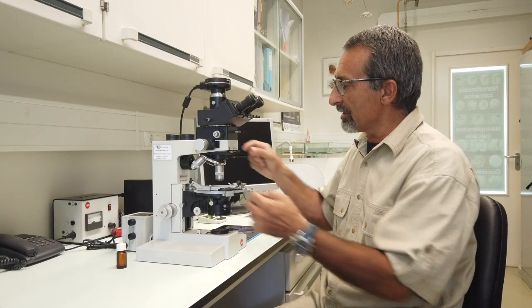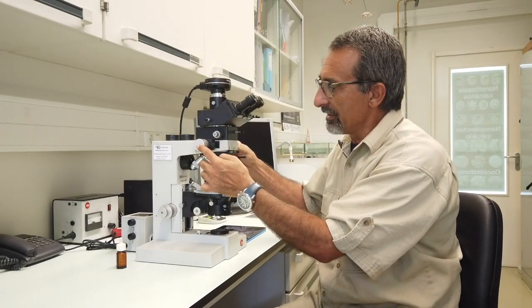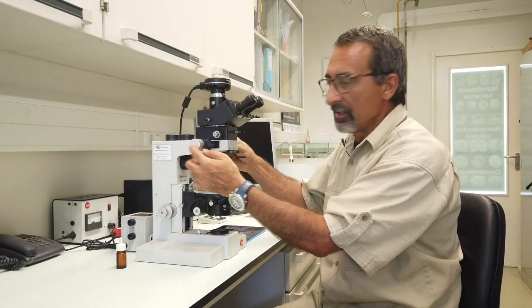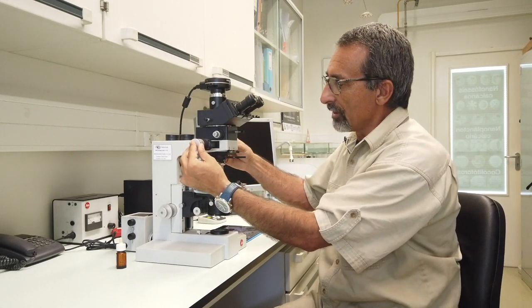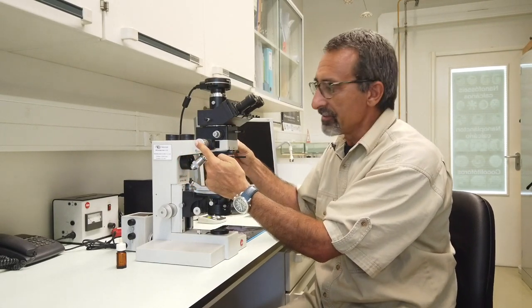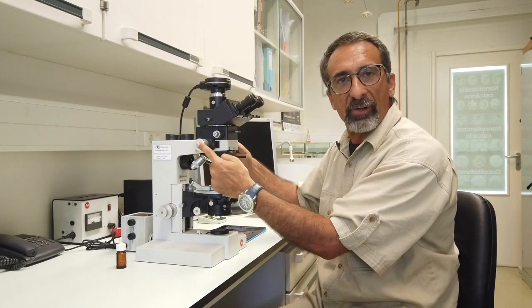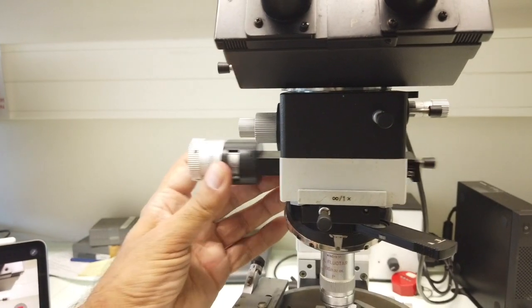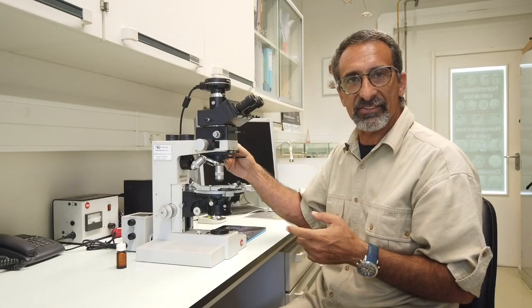We have here another polarizer. Here is the analyzer. We can remove it, we can insert it. So this is another polarizer that we'll discuss later on. It's called the analyzer.